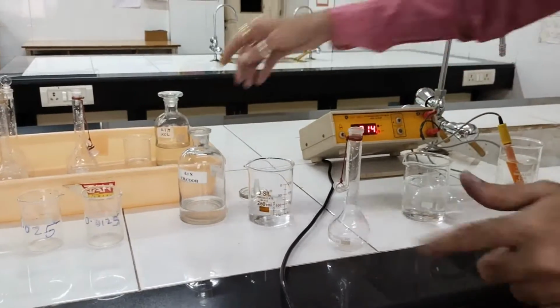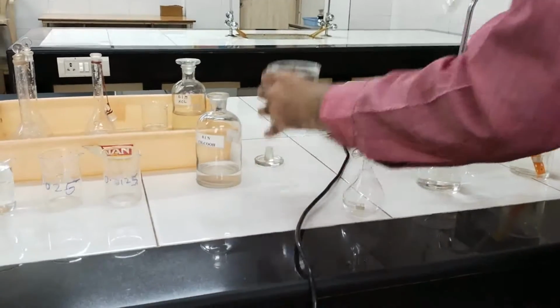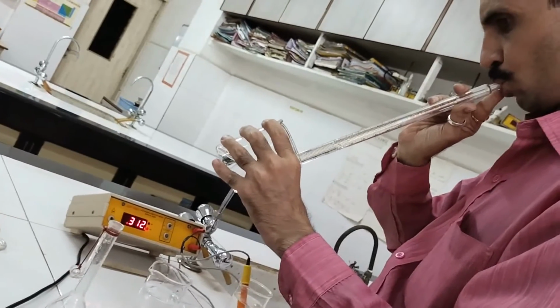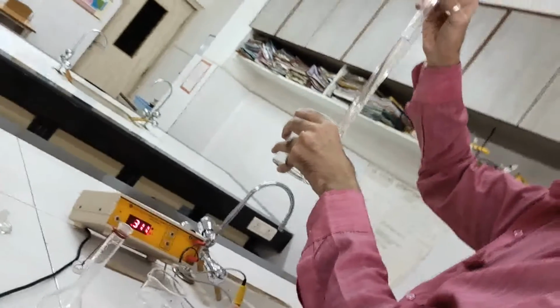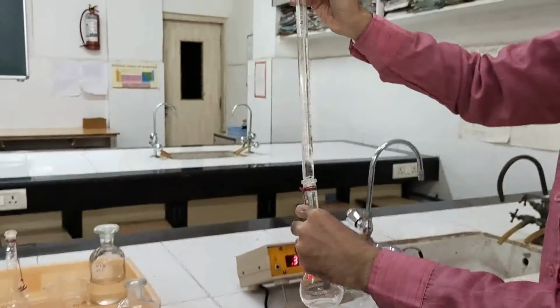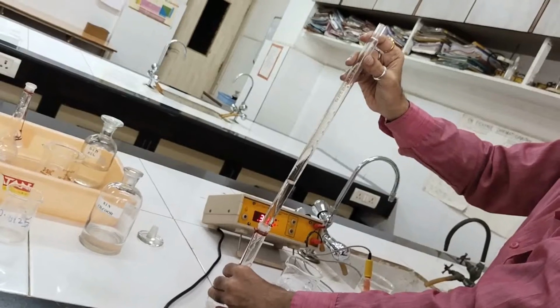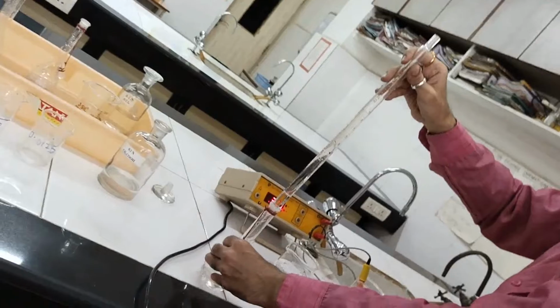So this time I am going to prepare only once. Previously I prepared twice. This time it is only once. So 25 ml I am going to prepare of acetic acid 0.1 normal. Okay, this is 25 ml. And that will be transferred into this same standard measuring flask which we used for the preparation of 0.05.